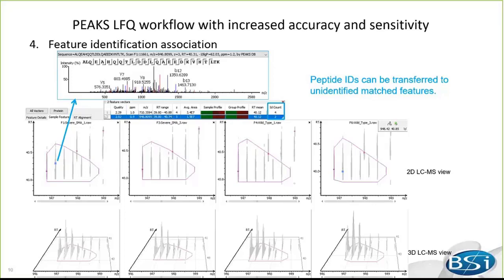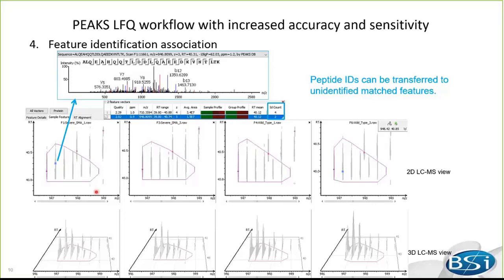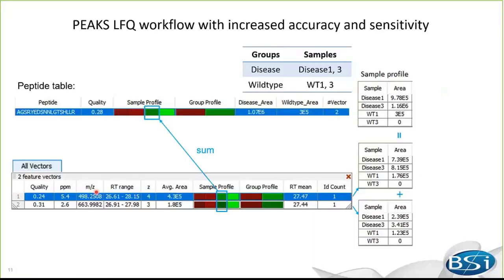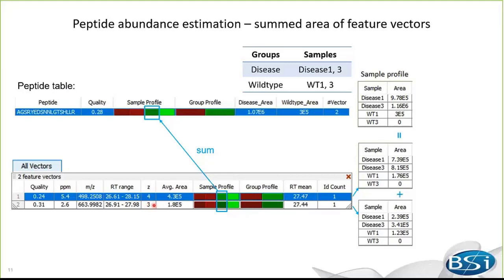In other words, as long as the peptide is identified in one sample, it can be quantified in all samples after alignment. From here, I'm going to show you how peaks calculates peptide and protein abundance. I'll start with the peptide abundance calculation. In this example, this peptide in the peptide table, which is newly added to peaks 8.5, has two charge states as shown in the associated feature vector table.